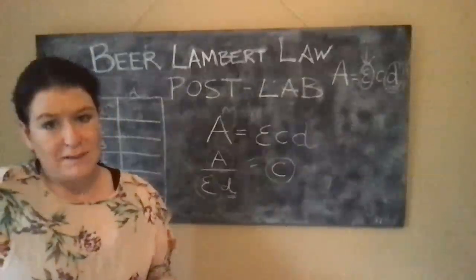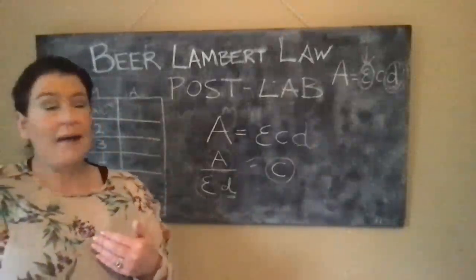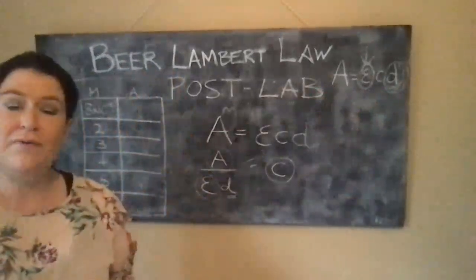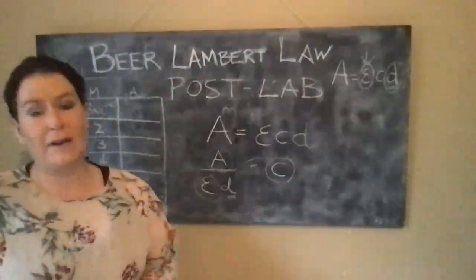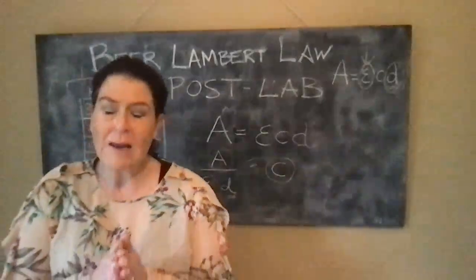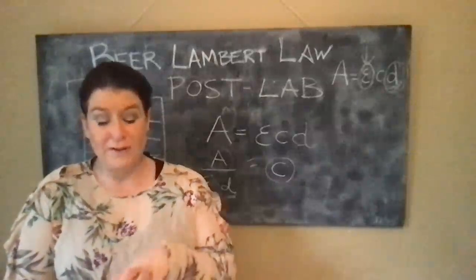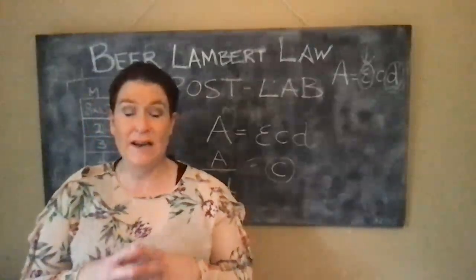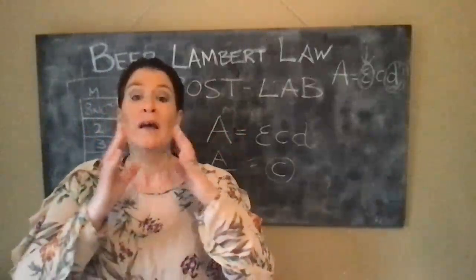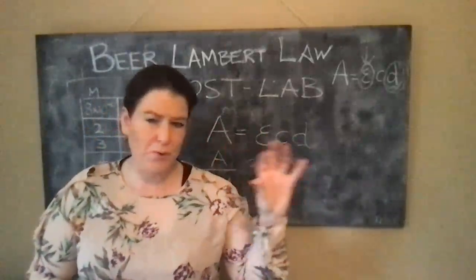But there are other aims. The other aim is to learn how to use serial dilutions, to learn how to understand the Beer-Lambert equation, and also to follow on with the questions that are in your lab report. So very quickly before I finish, let me just say this. Your lab reports need to be written up in the classic style Professor Lowry has asked: title, aim, introduction. Remember, keep your aim short and sweet, just two or three sentences.